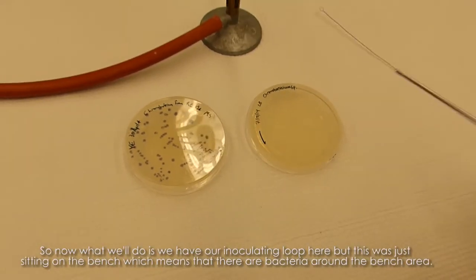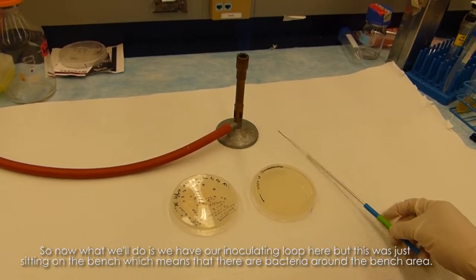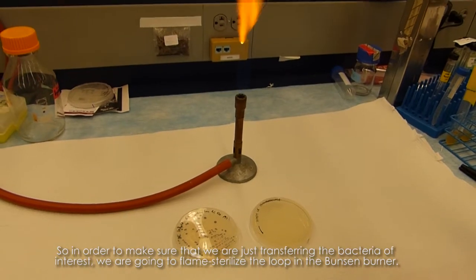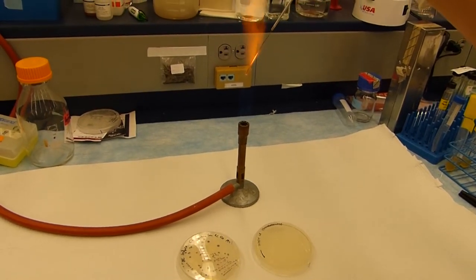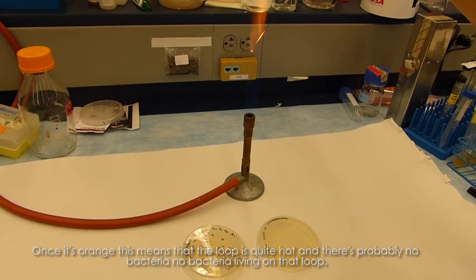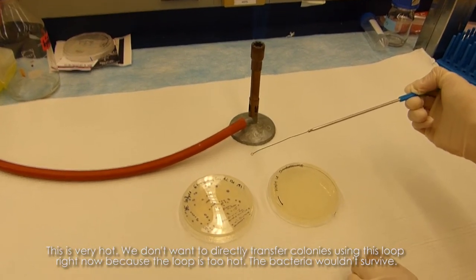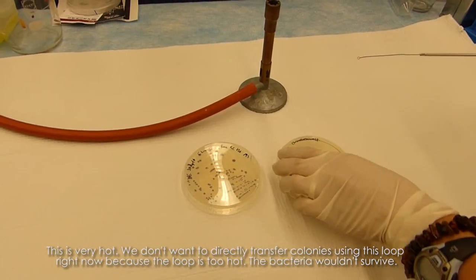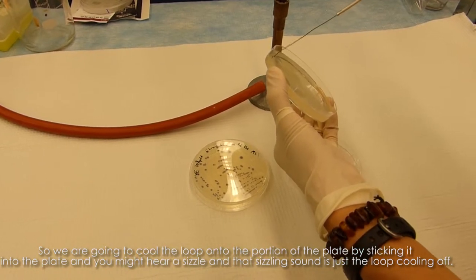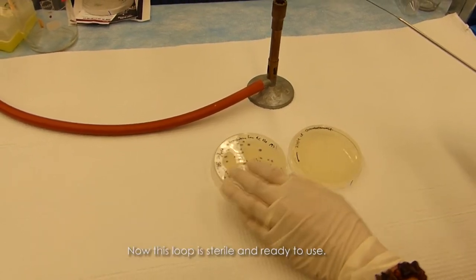We have our inoculating loop here, but it was just sitting on the bench, which means there could be bacteria on it from the surrounding area. So to make sure we're transferring only the bacteria of interest, we're going to flame sterilize the loop in the Bunsen burner. Once it glows orange, the loop is quite hot and there are no bacteria living on it. However, the loop is very hot — we don't want to transfer colonies yet because the bacteria wouldn't survive. So we cool the loop by touching it to a portion of the plate; the sizzling sound is just the loop cooling off. Now the loop is sterile and ready to use.